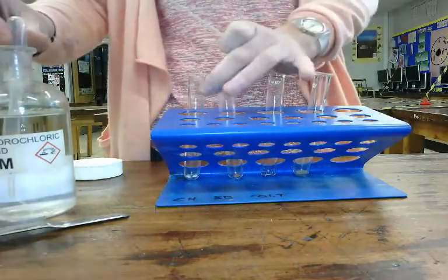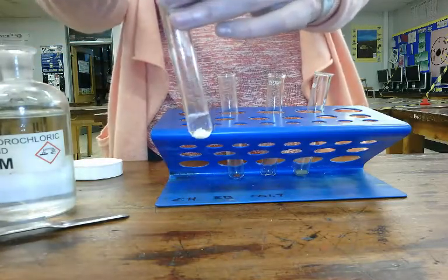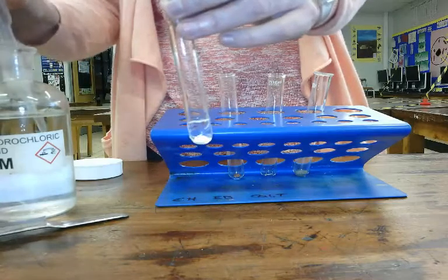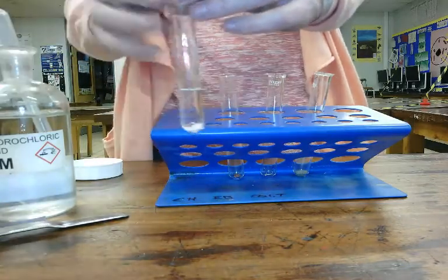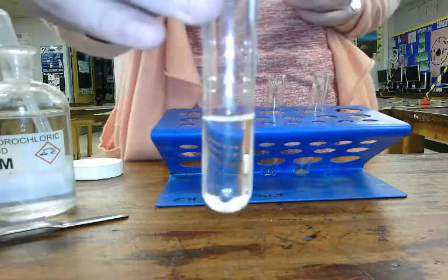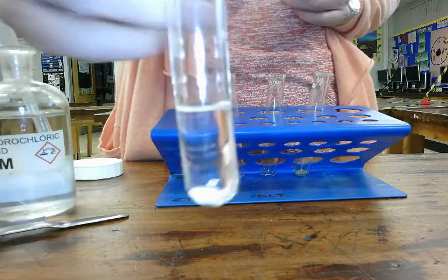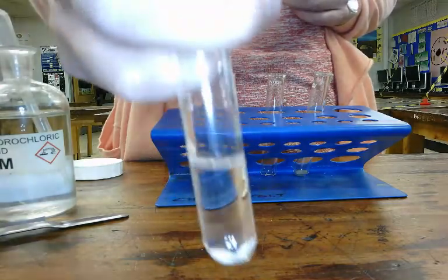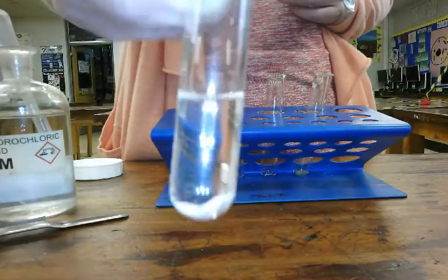So first of all, if we start with zinc, I add hydrochloric acid to zinc. Now if it fizzes, I'm going to hold my thumb over the top, and you can see that it is starting to fizz because it reacts with the acid. And I put my thumb over the top like that just to collect any gas that's being made.